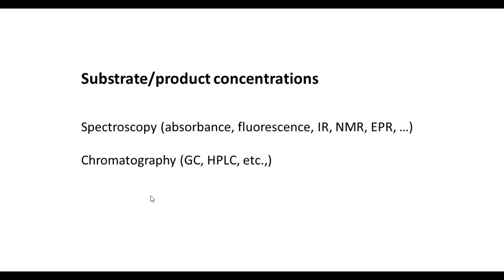Chromatographic methods can be used. Gas chromatography, high pressure liquid chromatography, HPLC, and so on, they can be used. And there are many such methods that can be effectively used. I think we have come to the end of module 2.